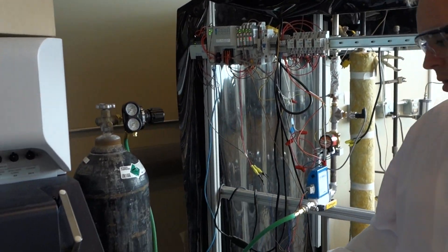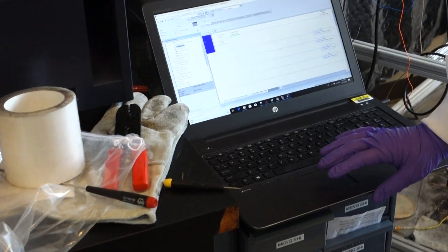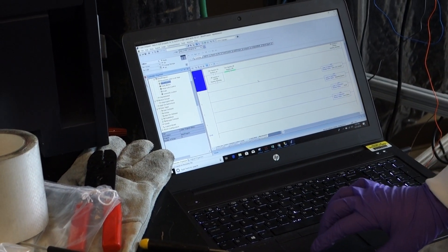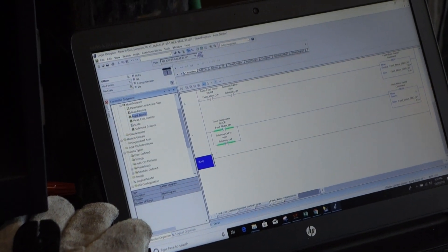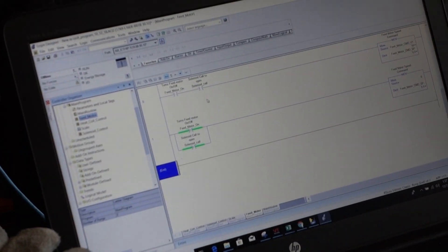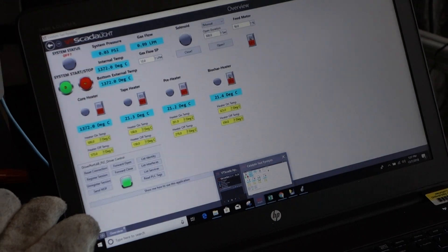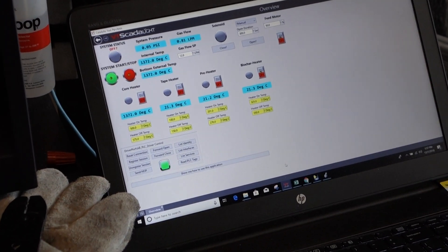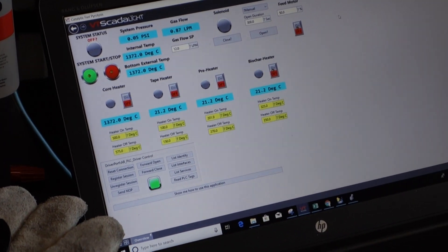Now, in order to control all of these, we are using the Studio 5000 software in which we use a ladder diagram to control all of our different components in our system. And with this, we developed a human-machine interface that creates ease of use. In one place, we can control all of the aspects of our system.